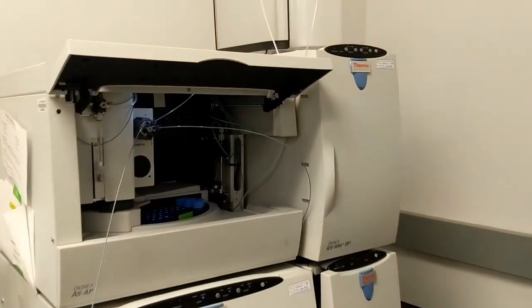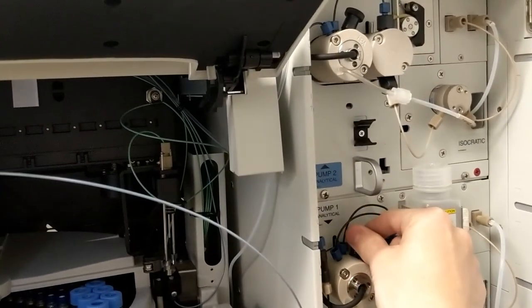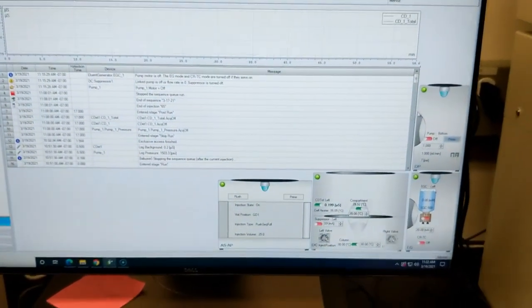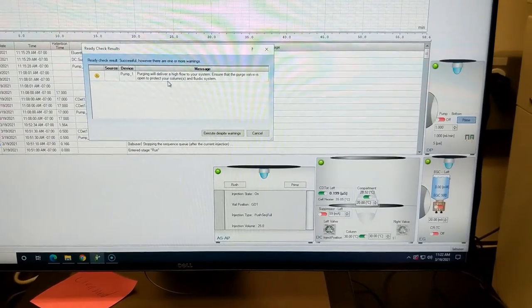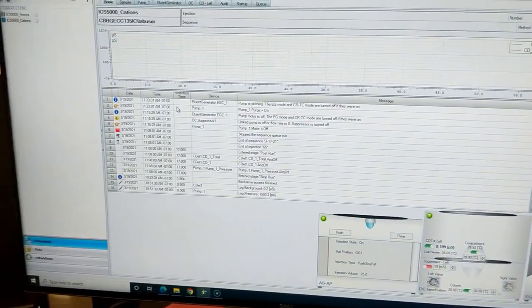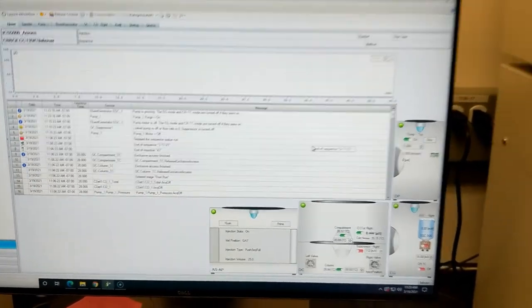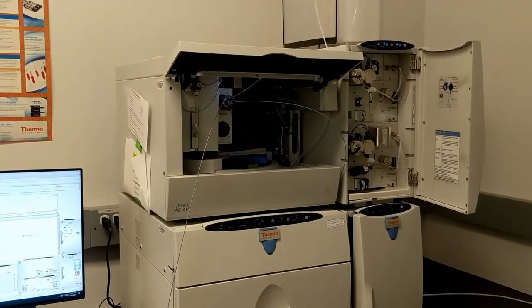To prime the pumps, first open up the pump compartment and open the prime valves — just one little half-turn to the left for both of them. Then in the software, on the cation side, hit Prime. It'll give a warning that purging will deliver high flow — make sure the purge valve is open. Hit Execute. Now do the same thing for the anion side: both valves are open, so prime them both and execute despite warnings. This will take about five minutes.